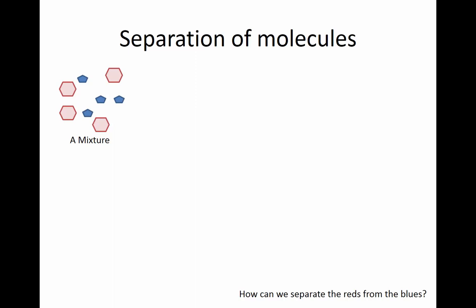And so when we have products from cell extracts or from growth media, products that have been secreted perhaps, regardless of where they come from though, we have a mixture of different kinds of molecules, and oftentimes something that we want to do is separate these molecules.